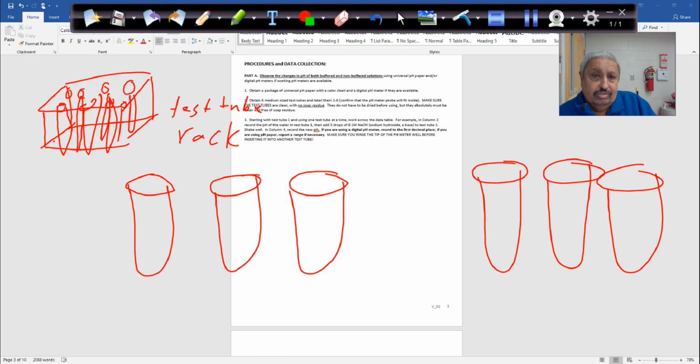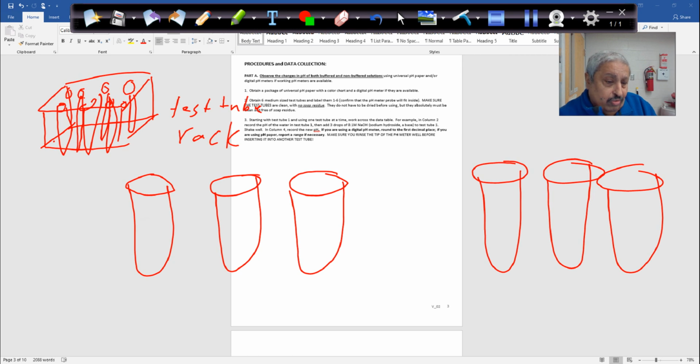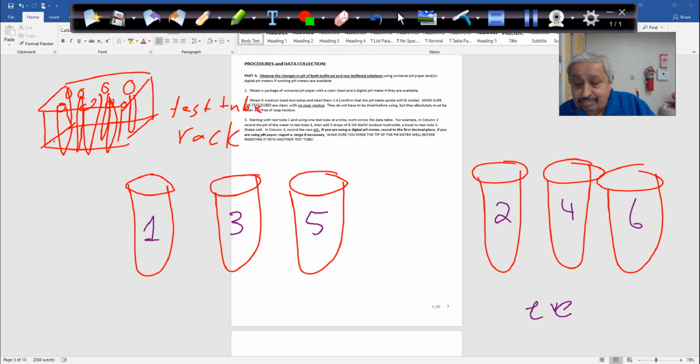So here it is. You number those as follows. This is number 1, number 3, number 5. This is number 2, 4, and 6. So, even numbers.